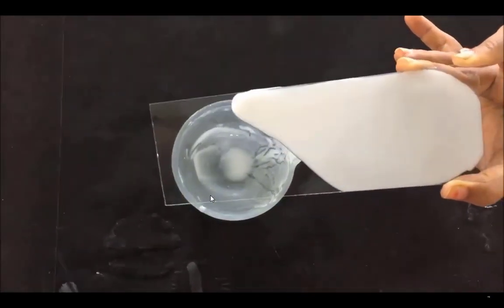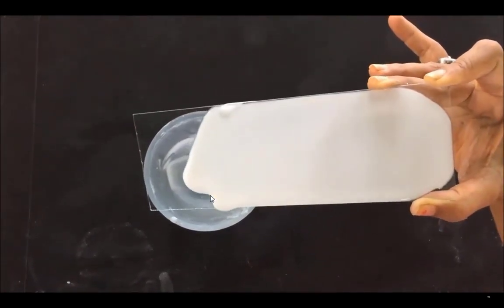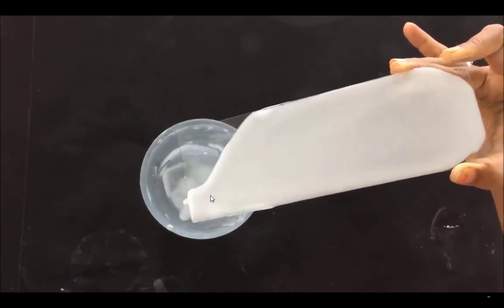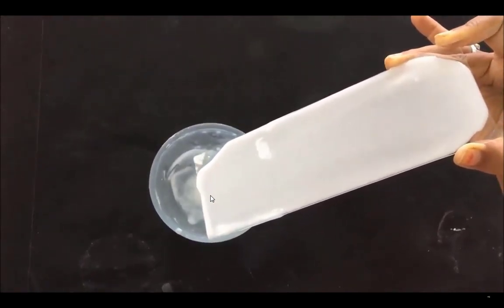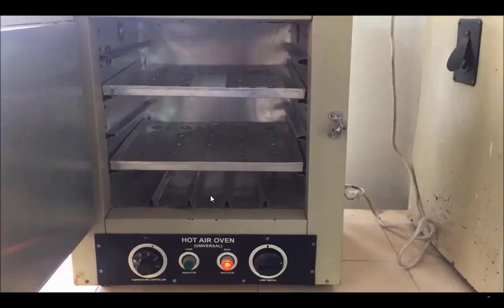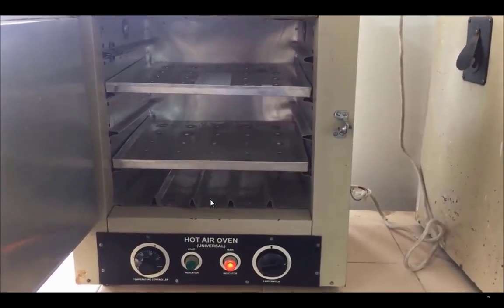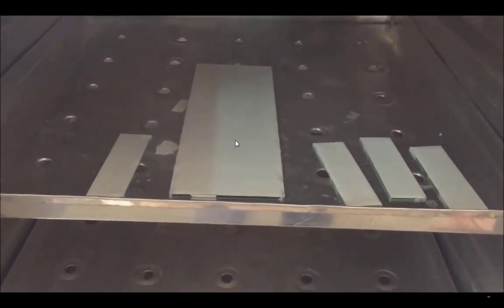Tilt the slide slowly in order to move the silica gel along the whole area of the slide. Keep on rotating the slide so that a uniform thin layer of silicon oxide can be produced over the microscopic slide. Then we dry that slide in an oven in order to remove all the moisture present in the microscopic plate. Therefore they get dried and ready for the separation.